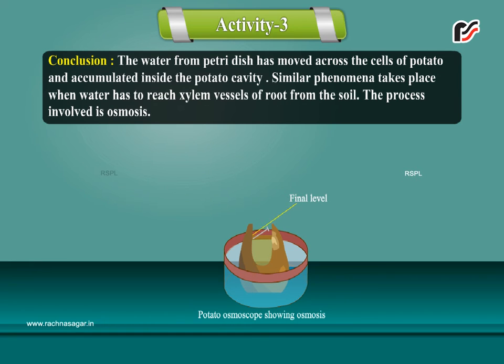Conclusion: The water from petri dish has moved across the cells of potato and accumulated inside the potato cavity. Similar phenomena takes place when water has to reach xylem vessels of root from the soil. The process involved is osmosis.